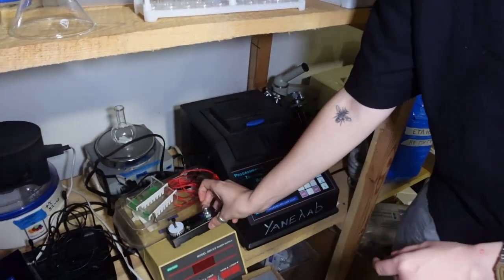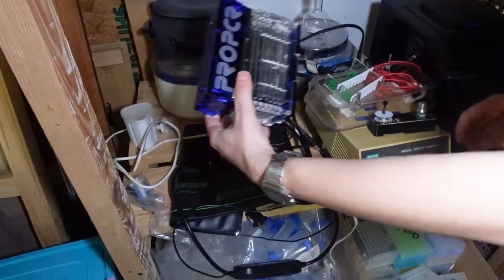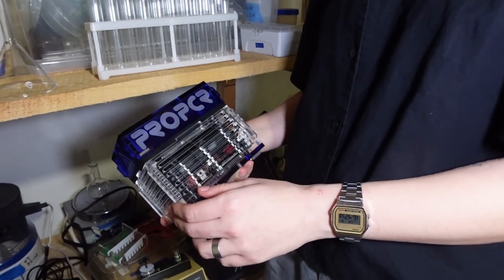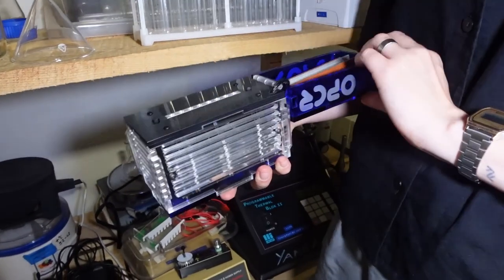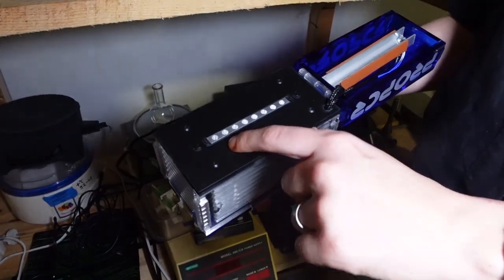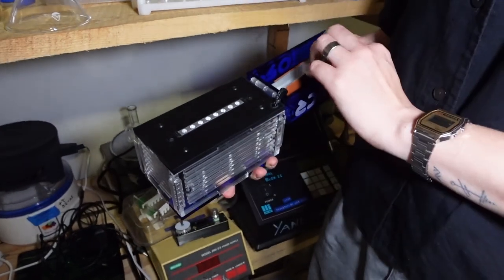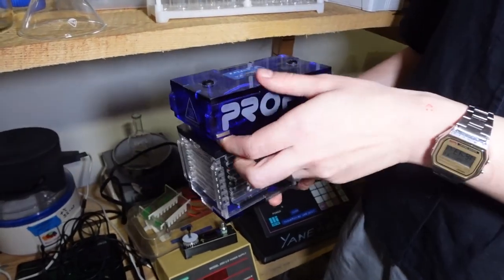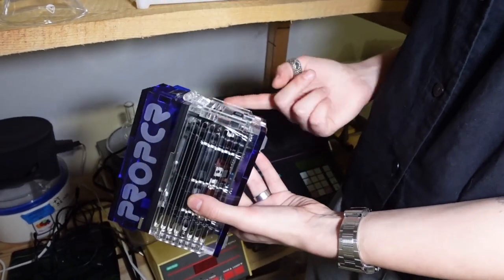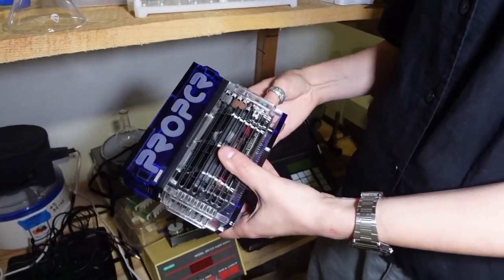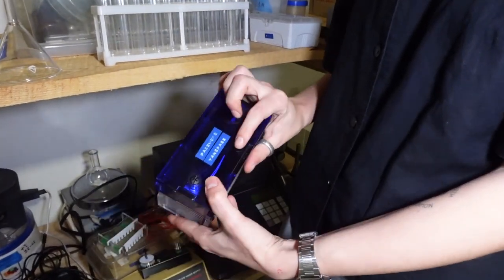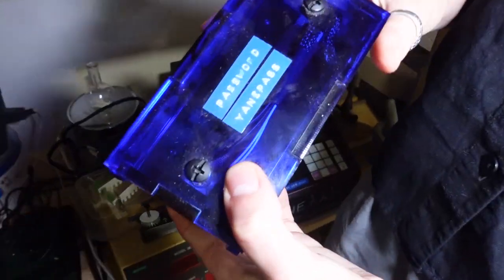I have this PCR machine, it's Pro PCR from Manifest Biology. Unfortunately they closed their business but I still have this PCR machine. It's pretty neat, it's a gradient PCR machine so you can choose different temperatures for each tube. You use WiFi, you just run it from your phone, you turn it on. You can program it from your phone and monitor it.